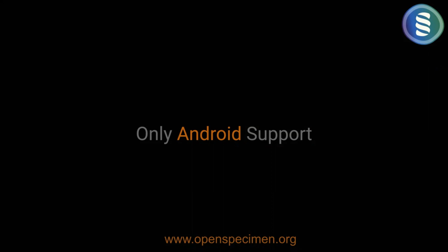When you develop native apps that you install on your phone, development on Apple is different from development on Android. So we'd rather focus on one platform and make it better until we figure out if there are enough people who want it on Apple.